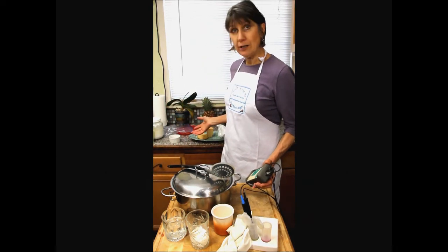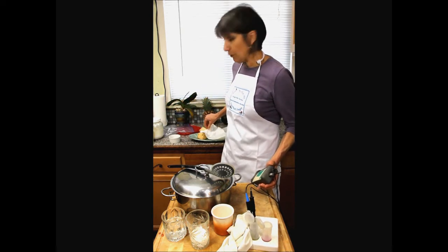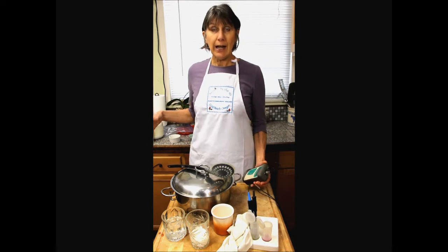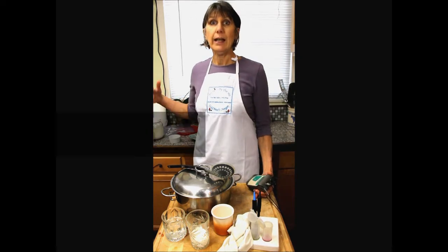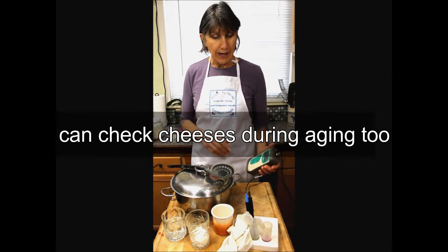Then we're also going to check the pH of some cheese, yogurt, and several types of cheese so that you can see how the results are and how you get an idea of what's normal and how to control it, and I'll talk about that.